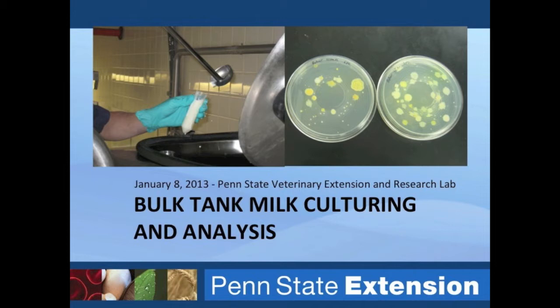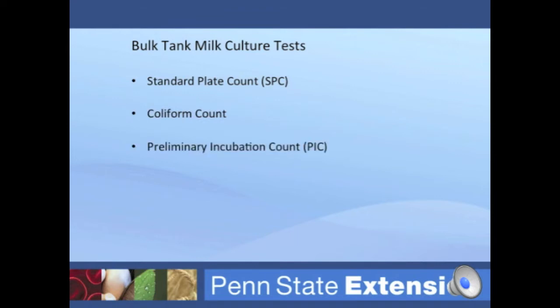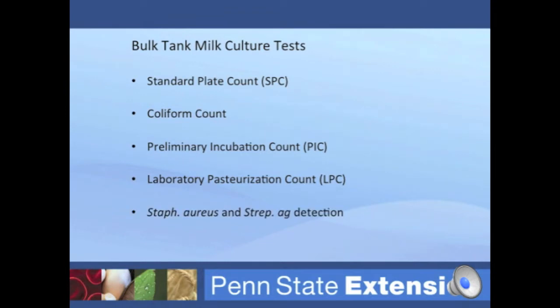will be reviewed. Because there are no official industry standards for bulk milk culturing, each lab may run cultures in a slightly different way, but the general principles and interpretation for each culture test is the same across labs. The tests shown in this video will include the standard plate count, coliform count, preliminary incubation count, laboratory pasteurization count, and Staph aureus and Strep agalactiae detection.